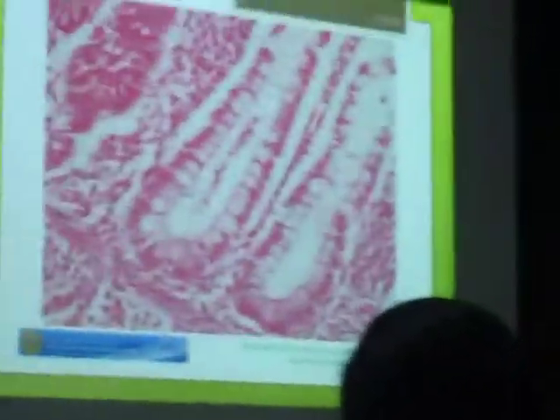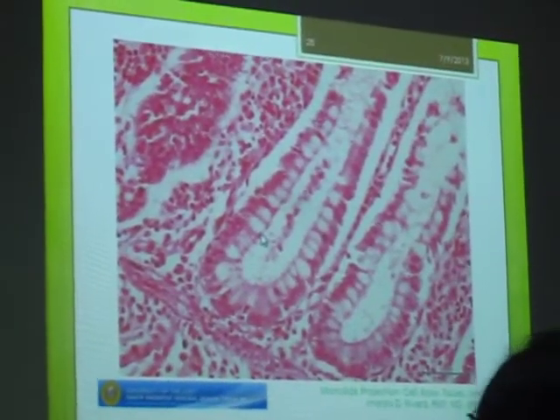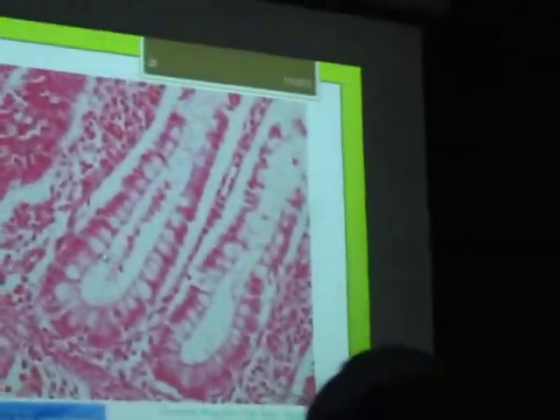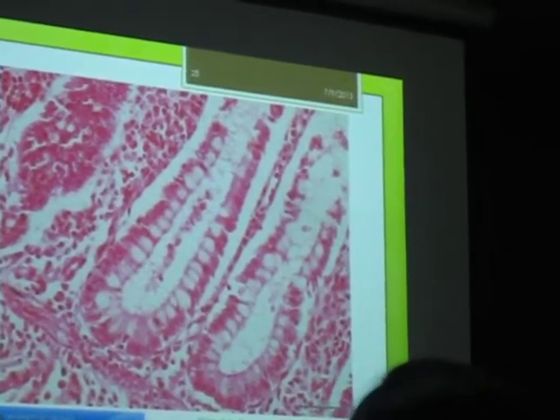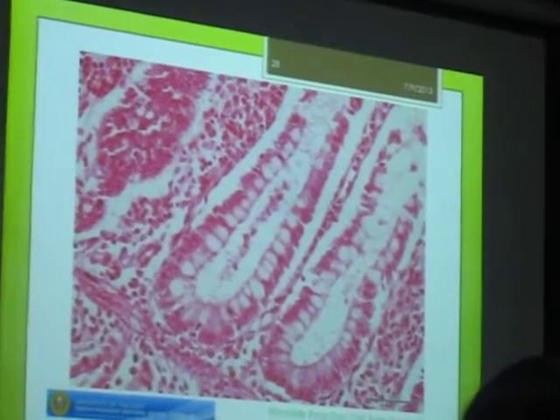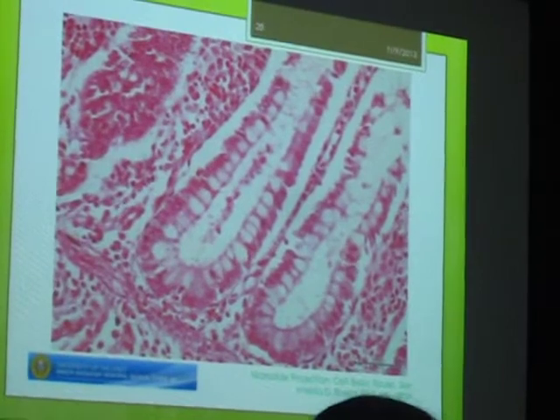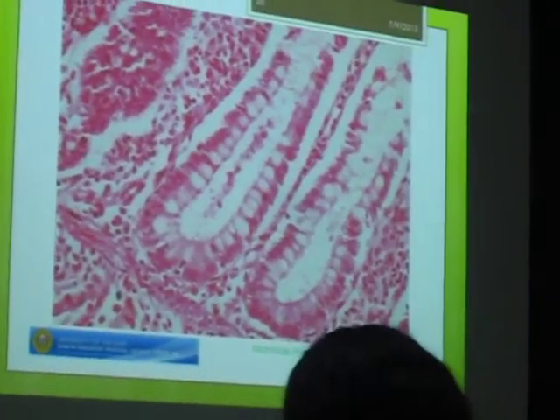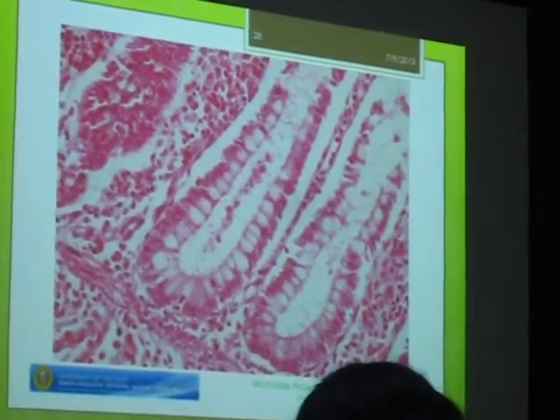Okay. Classify according to the nature of secretion. Ito pa rin, the same structure. How many types according to the nature of secretion? We have mucus, serous, mixed, or mucoserous. So, which of the three?